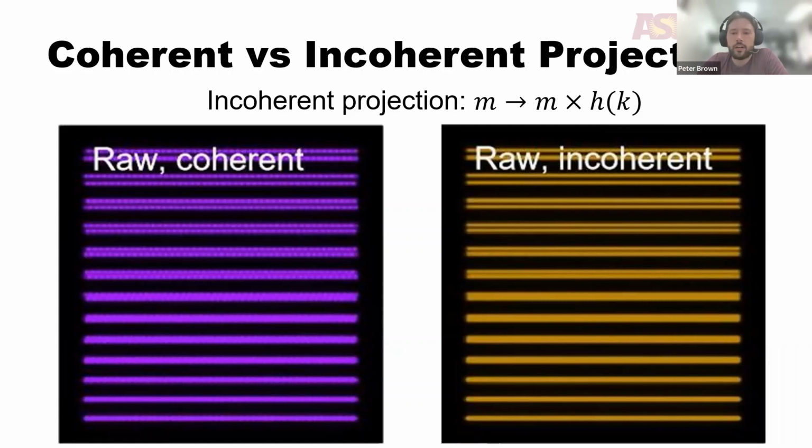In the case of optical sectioning SIM, where we're using a low frequency pattern, this is not so important, but in super resolution SIM, where an aggressive pattern may use 90 to 95% of the maximum frequency of the system, the value of the optical transfer function here can be on the order of 1 to 10%, and so this is a substantial hit.